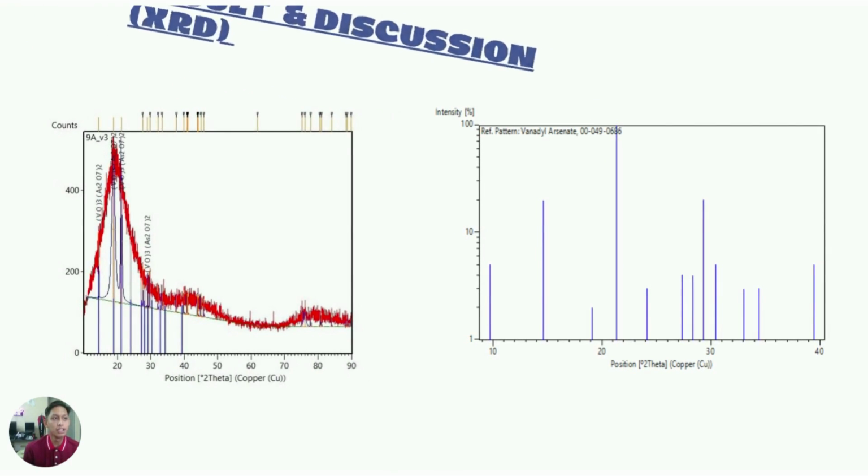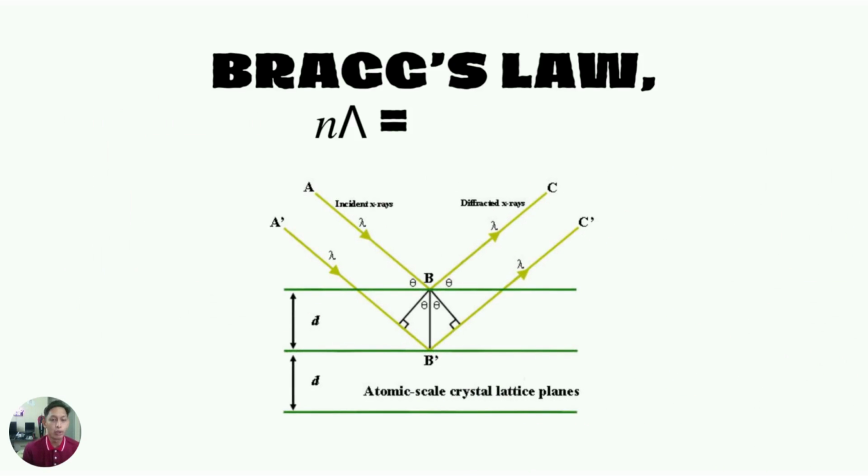The diffraction of X-ray is described by Bragg's law equation. In short, Bragg's equation must be satisfied with information such as the wavelength and the angle of the peak intensity in order to get information of the material such as crystal structure and others. In conclusion, the XRD method is used to gain much information of a material for a better understanding of the characteristics of the material.